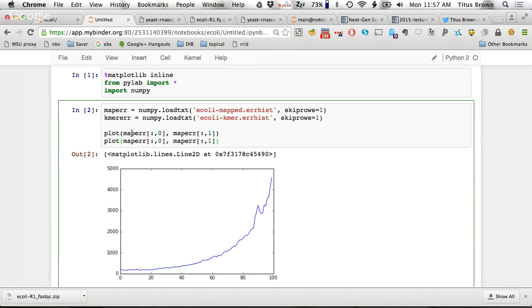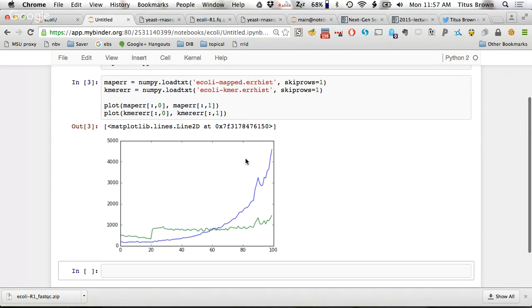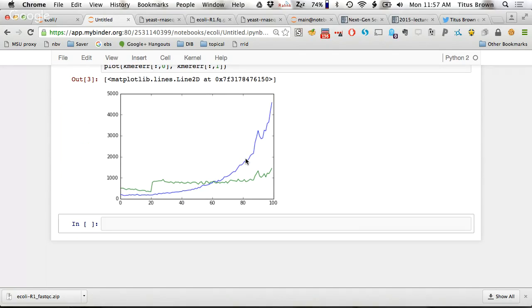It all works. So here, you can see it actually underestimates the error in the 3' end. It has some weird bits here. It's actually a little bit weird. I think this is from a bug that I actually fixed that isn't installed into the software. The main thing to note is that you actually see similar patterns of high error rates in these two profiles.